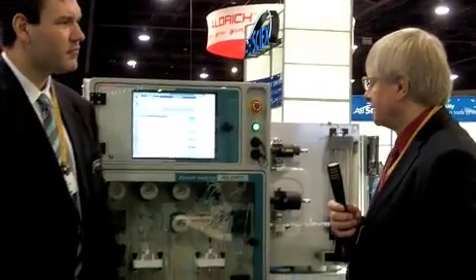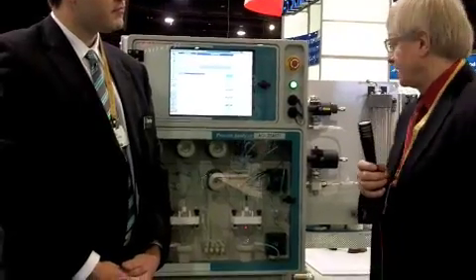Hi, I'm Tim Stutt, Editor-in-Chief of Laboratory Equipment, and we're at PITCOM 2011 with Nils Gell from Metrom. He's going to tell us about the Metrom ADI 2045 Ti Process Analyzer.